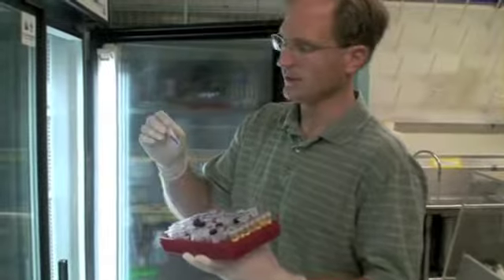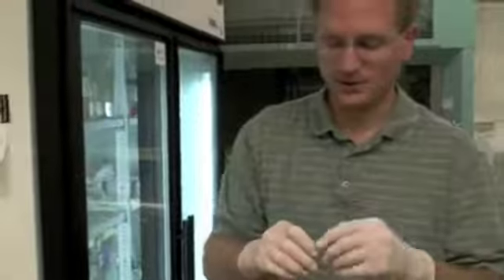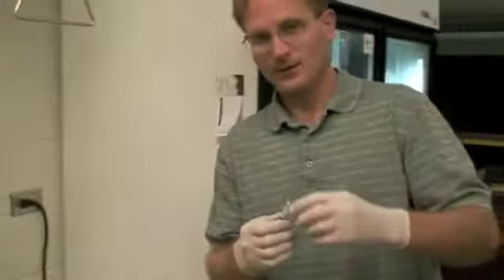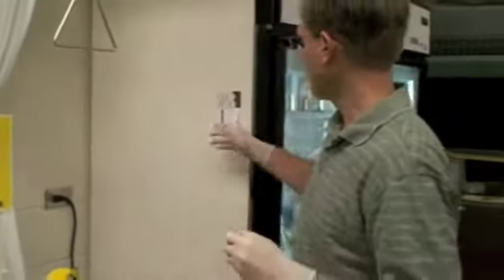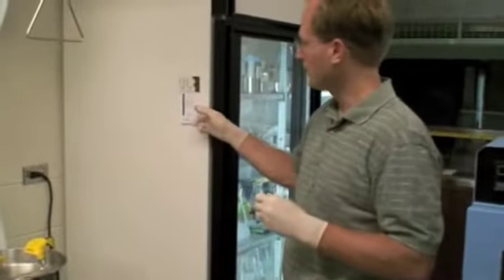There's this one here, but this is the Quanti marker, and that's what we'll be using for this semester. The base pair of fragments that you see are right here. There's a magnet here on the side of the beer cooler.